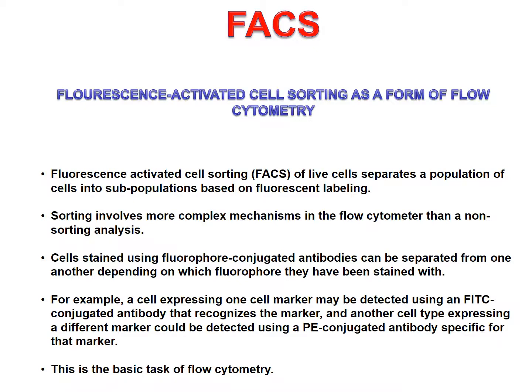Welcome back. We are going to hit fluorescence activated cell sorting. This is a form of flow cytometry. It's a special type. Clearly the word fluorescence activated means that there has to be fluorescent molecules.